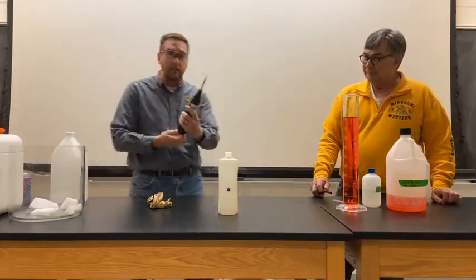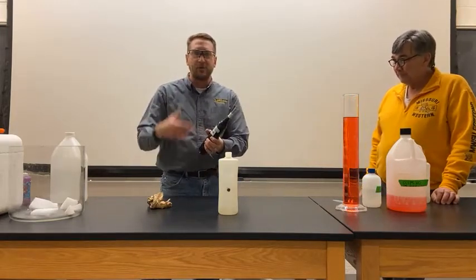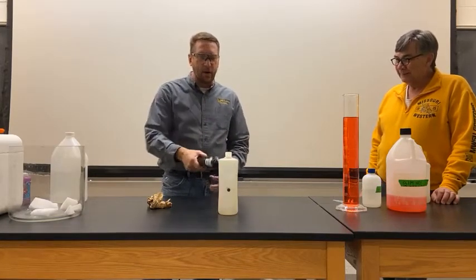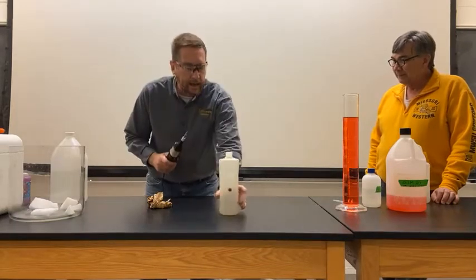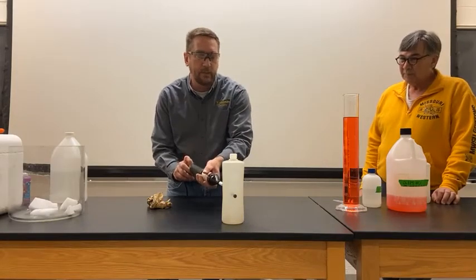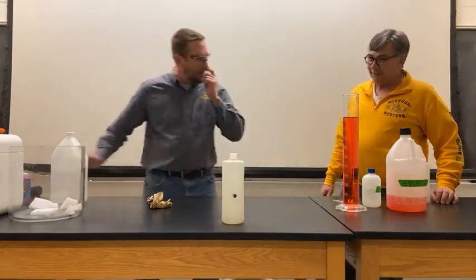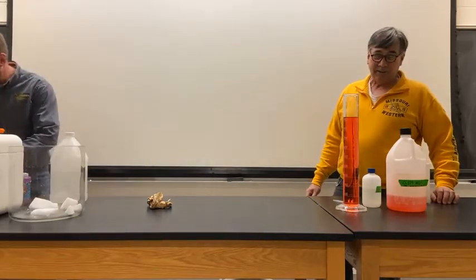So I'm going to add some electricity to this. Hopefully this does not mess with our feed a little bit. So I have what's called a Tesla coil. So this is basically going to give us a spark to drop into our little tube here. So I'm going to go ahead and put this in. Here we go. There we go. That is cool. That was good. Yep. That was good. Nice job. All right. Thank you, Nikola Tesla.